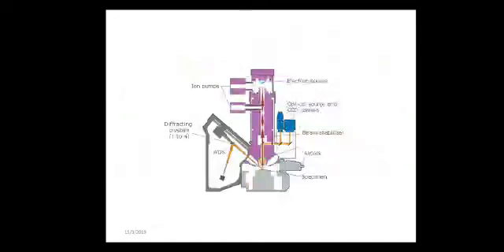So these are some advantages of the electron probe microanalyzer.